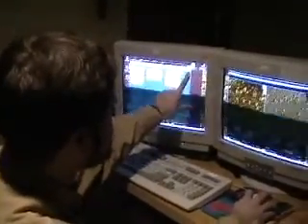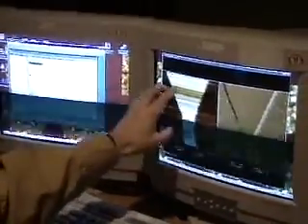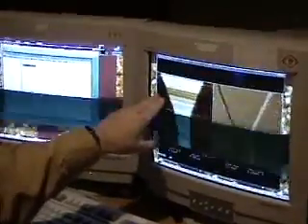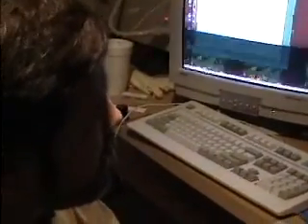Let's look briefly at the analysis options, which are accessed by clicking on this colorful TV icon in the upper right. Here is a typical image that we have accumulated in the way that it is saved to disk, and you can see that there are a lot of different streaks horizontally. Some of that streakiness comes because as the tip is scanning along, it might pick up an extra piece of dirt, which changes the height of the tip and therefore the apparent height of the sample. And some of it comes from thermal drift in the instrument.